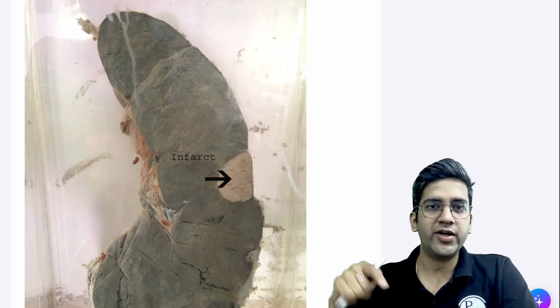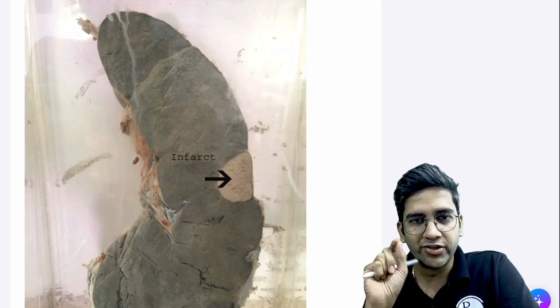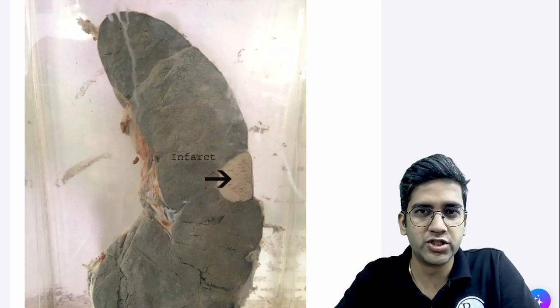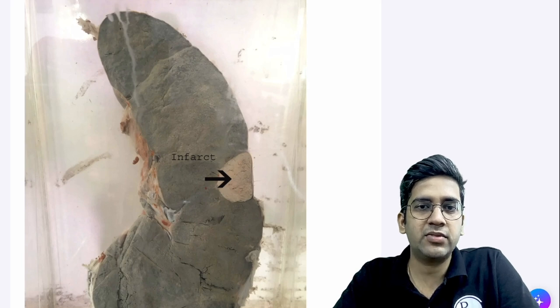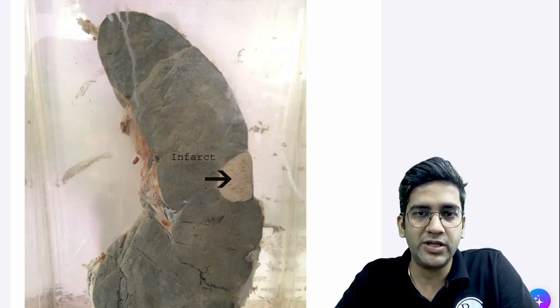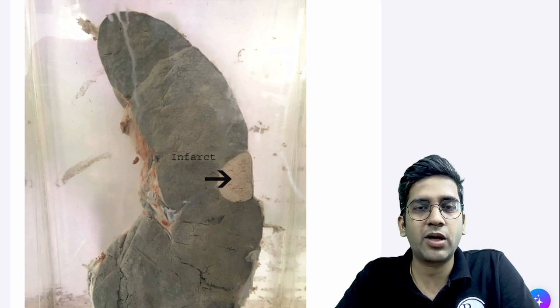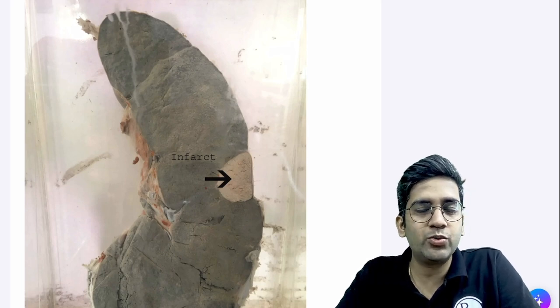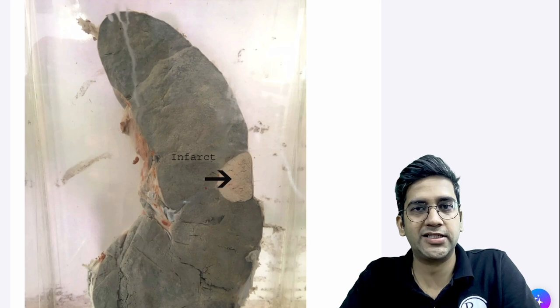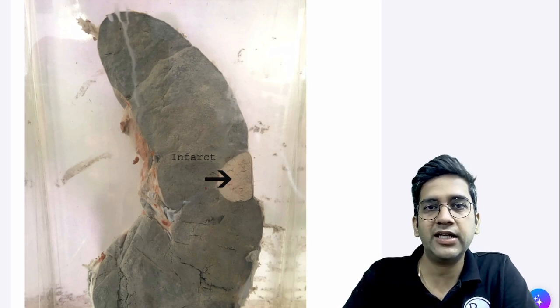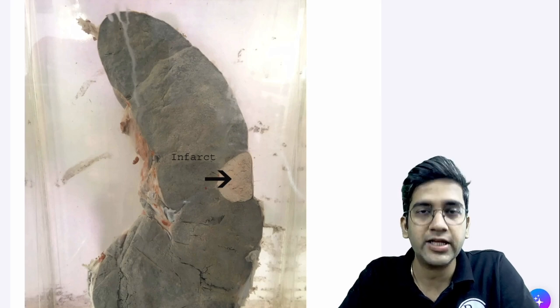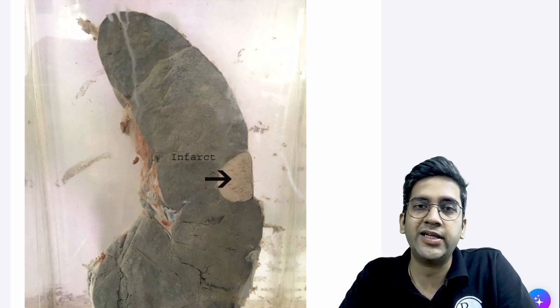It's like a rounded or with rounded edges and an elongated structure and the hilum. It does not have a lobe so it's unlikely to be liver, and the cut surface is little bit brownish in color, most probably due to the vascularity of the spleen. The altered blood color has become the brownish-black appearance. So due to this reason I am telling it's a spleen.